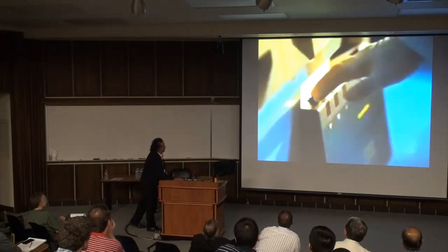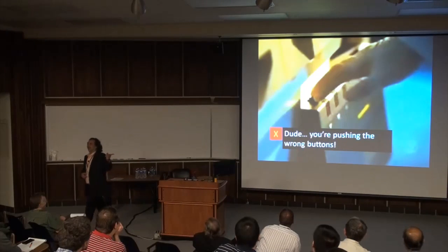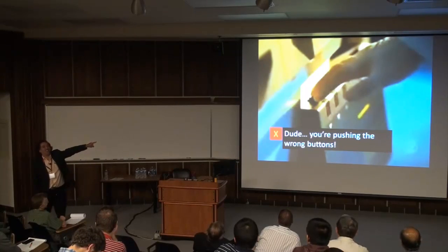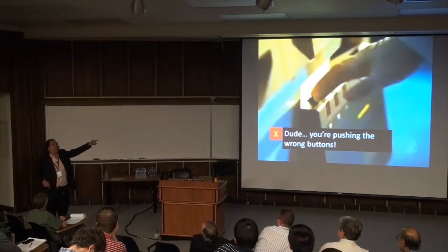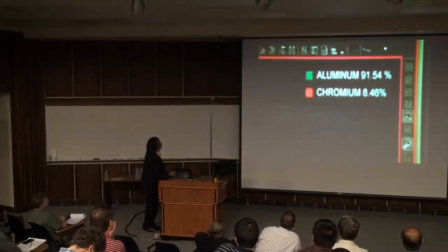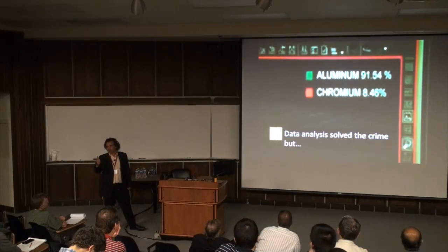Now, that's where the thing starts getting weird. Dude, you are pushing the wrong button. The machine was already on, and that button, if you have done the tour, you'll see, will turn off the machine, not start it. Data analysis solves the crime. Good.